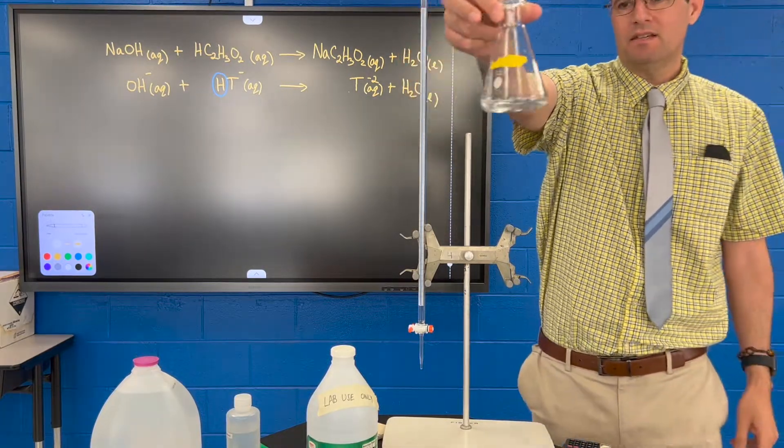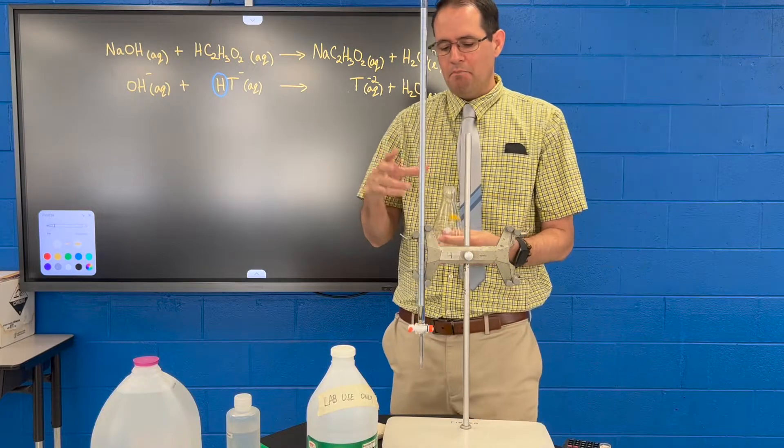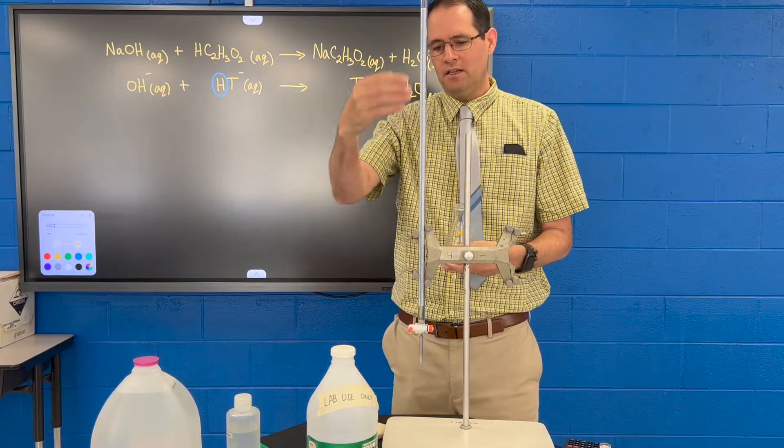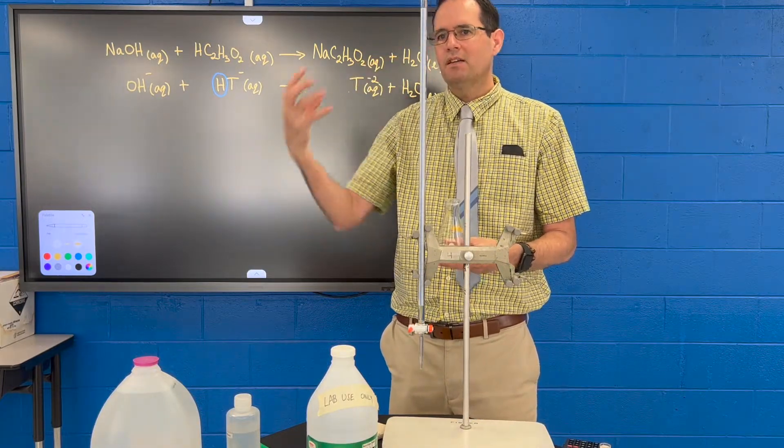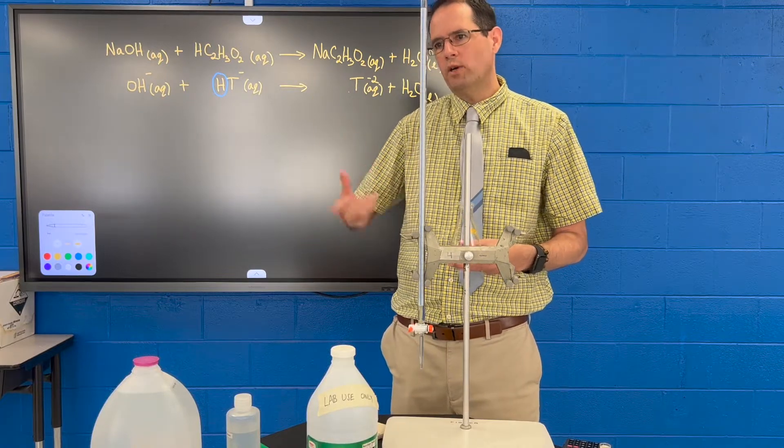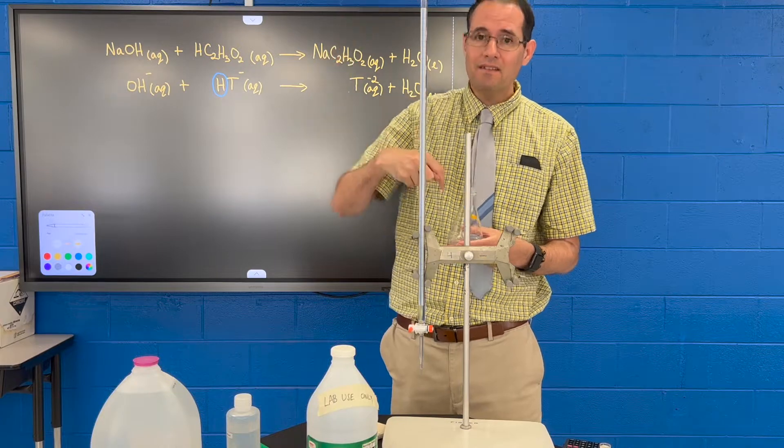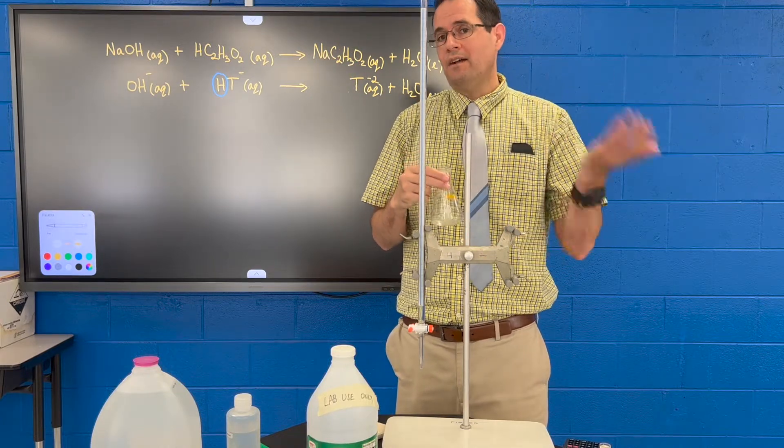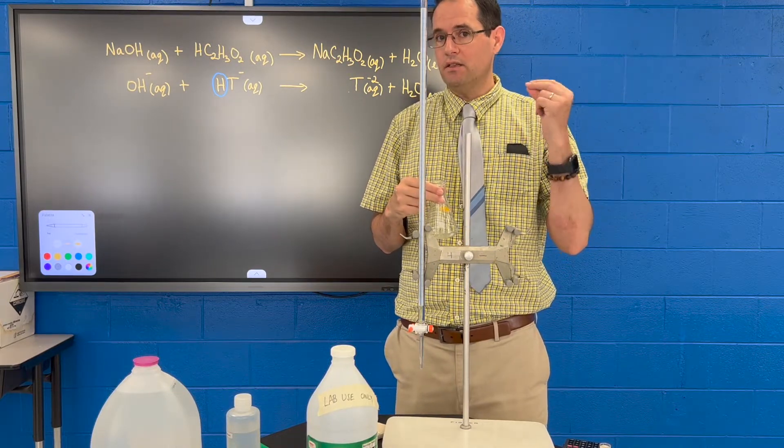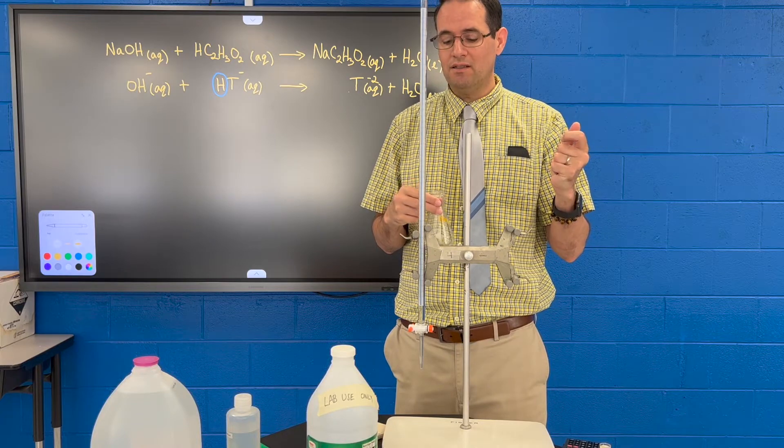Put a drop of phenolphthalein in here, and it's colorless. So phenolphthalein is colorless in acidic solution like acetic acid. But when we add sodium hydroxide drop by drop, it will gradually react with more and more acid until it's all used up, and then the next drop that hits the solution will then react with phenolphthalein to give you that purple color. So that's immediately when you want to stop the titration.